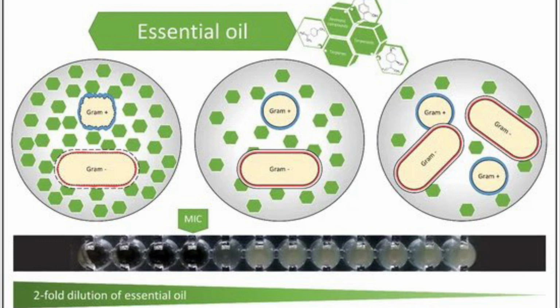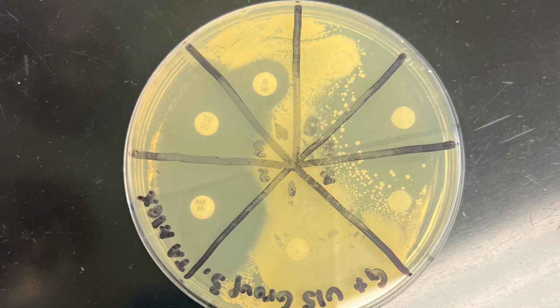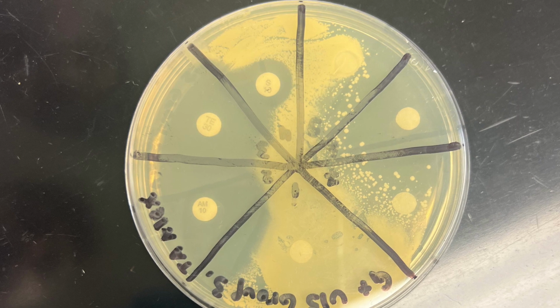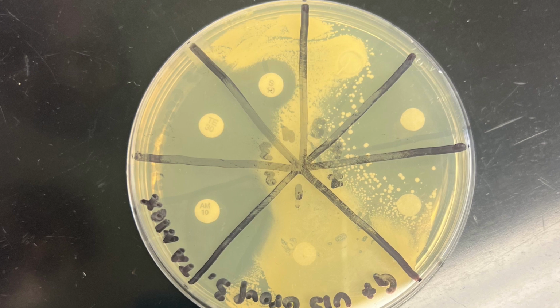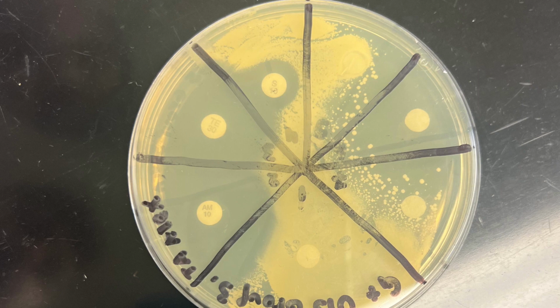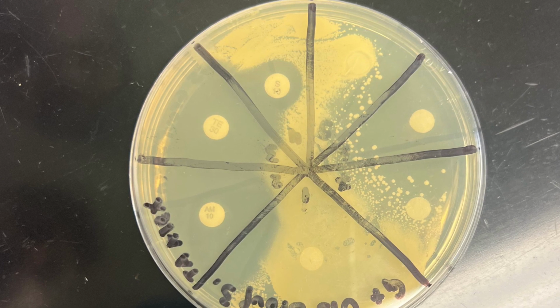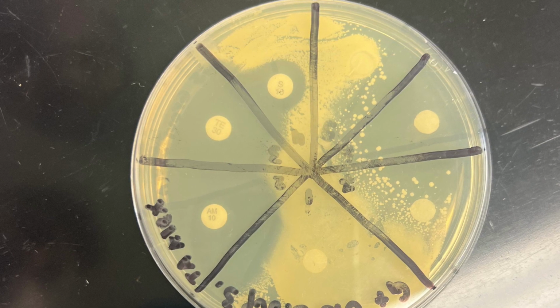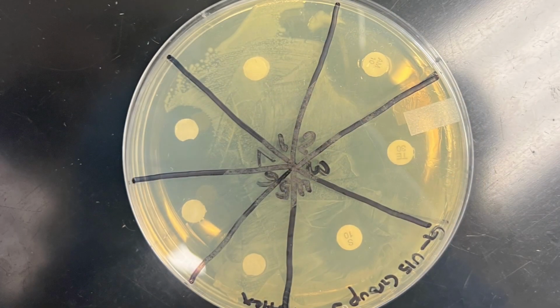The main topics covered in this project are the zone of inhibition around the antibiotic disc and how it indicates that an antibiotic was effective in slowing or killing bacterial growth. You can use the zone of inhibition to assess how well the antibiotic is working against the bacterium. We also discuss how determining the zone of inhibition for each treatment enables us to determine how effective each treatment is against bacteria. Bacterial diseases today are at an all time high.